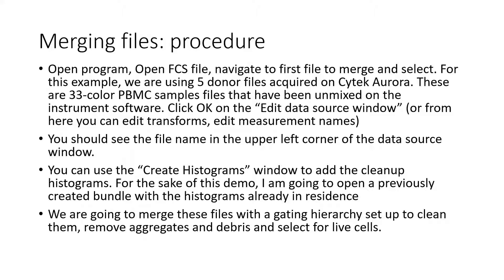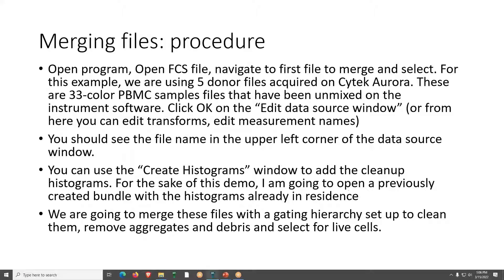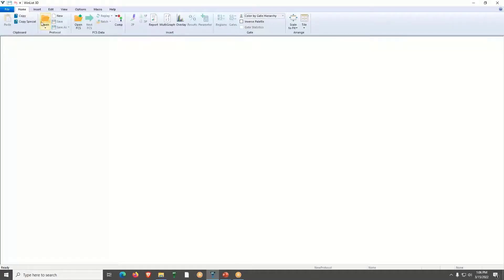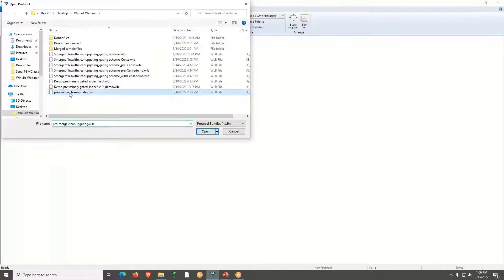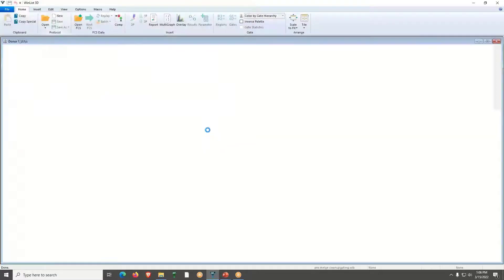The next window is the Create Histograms window, where you can add cleanup histograms. For this demo, I'm going to open a previously created bundle with histograms already in place. We're going to merge these files with a gating hierarchy set up to clean them — removing aggregates and debris and selecting for live cells. Now I'm going to come to WinList and open that protocol bundle.